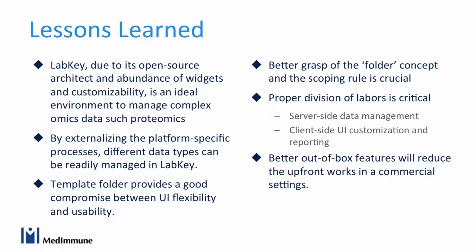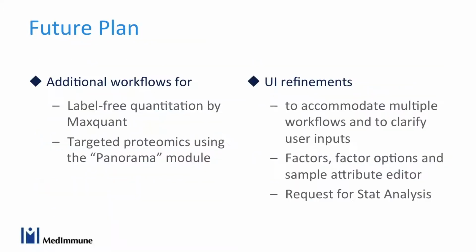So it took quite a bit of work and imagination to see what LabKey can do, and to convince our users that if we actually design the UI customization a certain way, this is what we're going to see. When we first demoed it, it was a little different from what we were expecting. But this is nobody's fault. It's the advantage of LabKey that it gives you a very nice infrastructure and skeleton and a lot of customization, but you still have to learn the system very well.